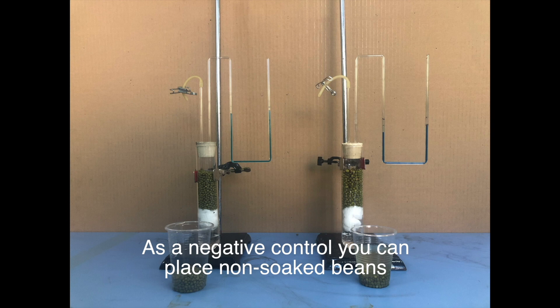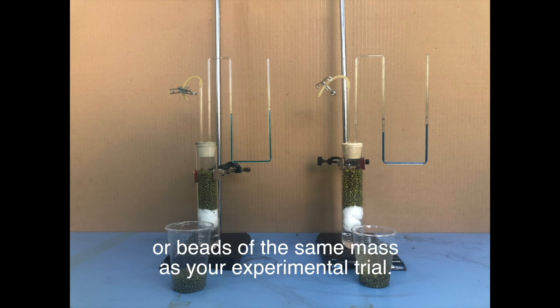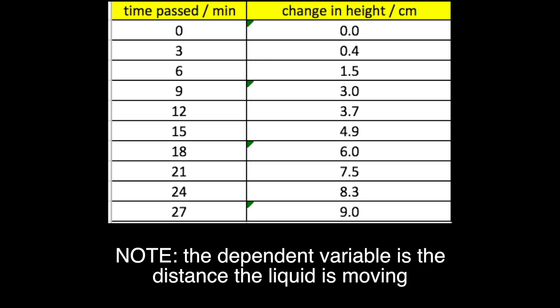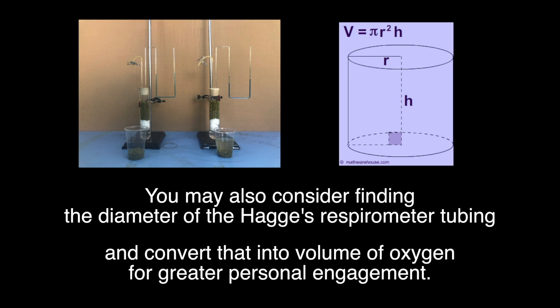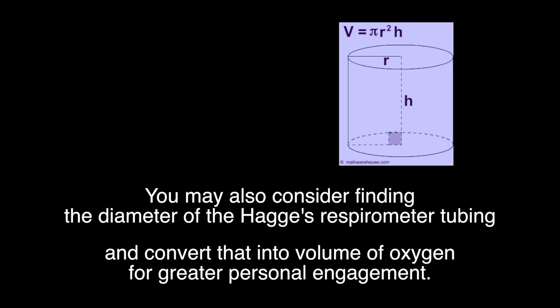As a negative control, you can place non-soaked beans or beads of the same mass as your experimental trial. Note that the dependent variable is the distance the liquid is moving. This could be converted into a rate. You may also consider finding the diameter of the Hagi respirometer tubing and convert that into volume of oxygen for greater personal engagement.